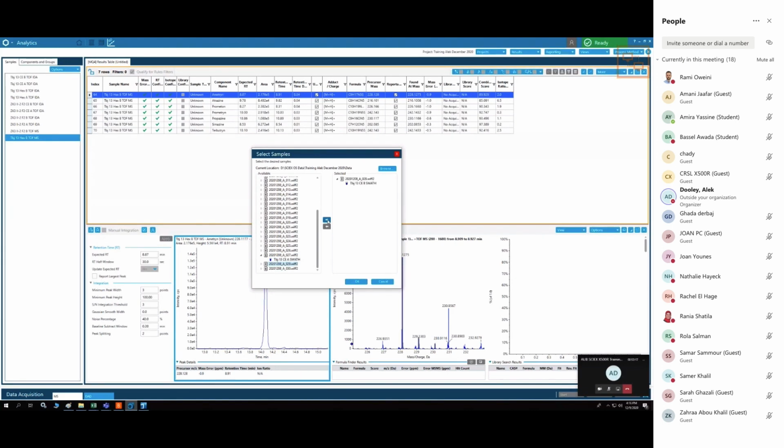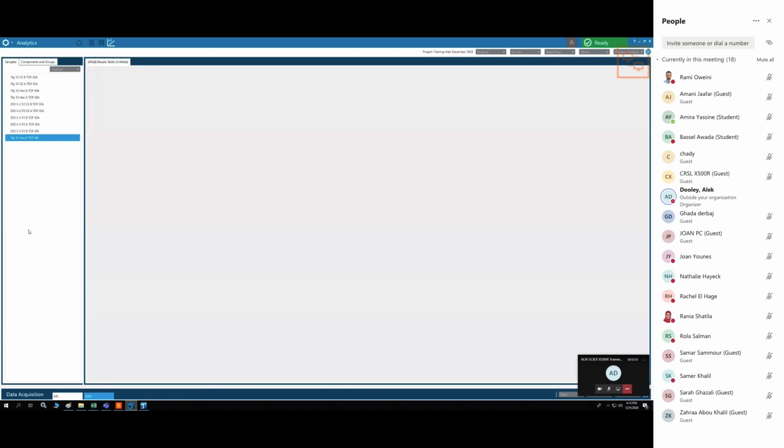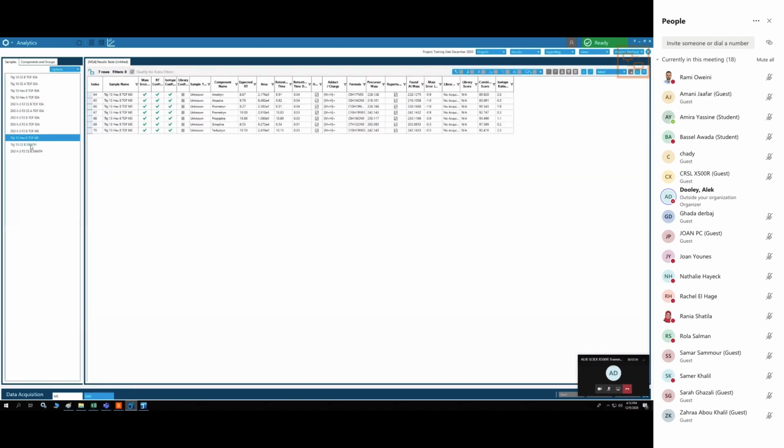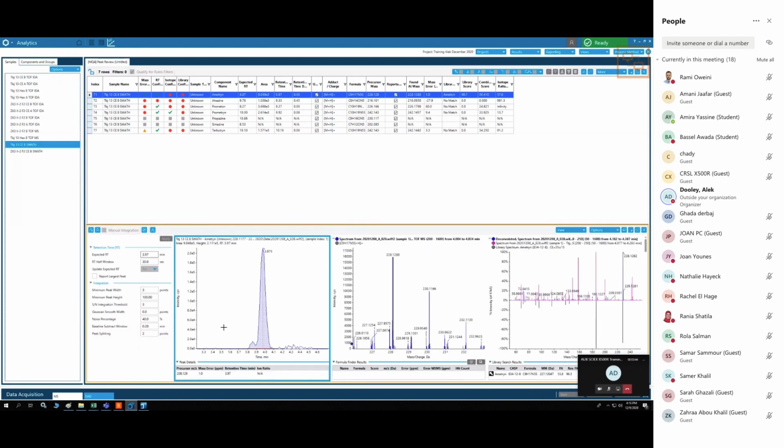Yeah, I want to add that one. And let's find an XK, whatever ZK. There we go. Add that one too. Okay, process that. So these were run towards the end of the batch. So that means in time also, I don't see any green. Back to early. Correct.